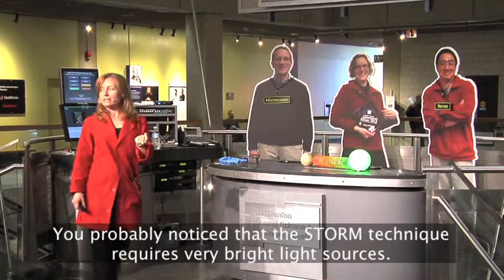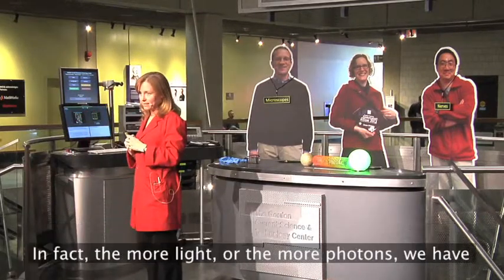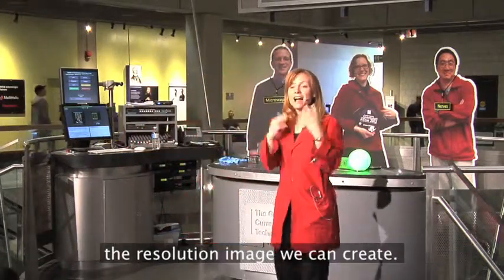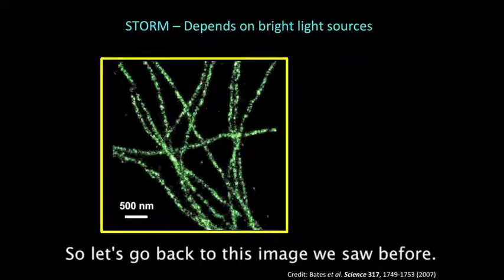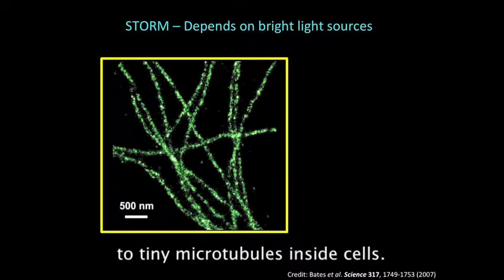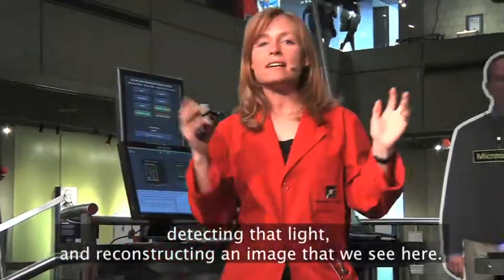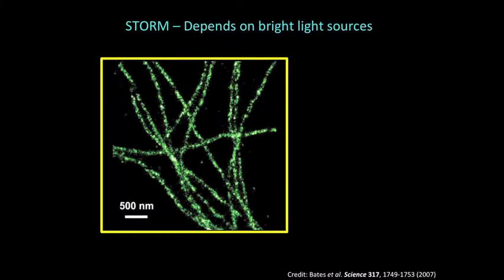You've probably noticed that the STORM technique requires very bright light sources. In fact, the more light or the more photons we have, the higher resolution image we can create. So let's go back to this image we saw before. Researchers created this image by attaching green fluorescent dyes to tiny microtubules inside cells, getting those dyes to basically blink on and off, detecting that light, reconstructing an image that we see here.